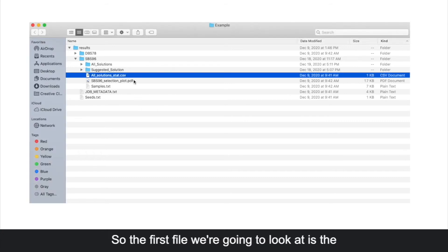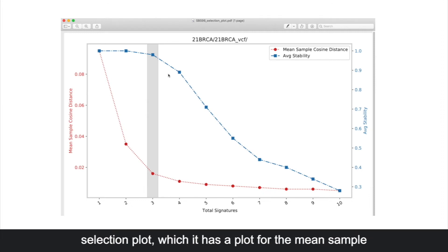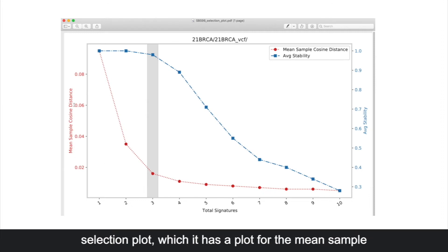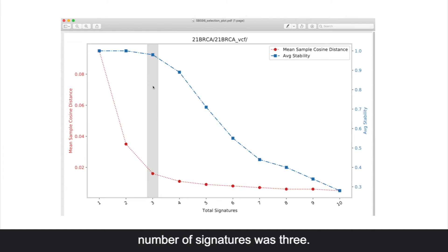The first file we're going to look at is the selection plot, which has a plot for the mean sample cosine distance, as well as the average stability. We see here at the vertical gray bar that the optimal number of signatures was three.